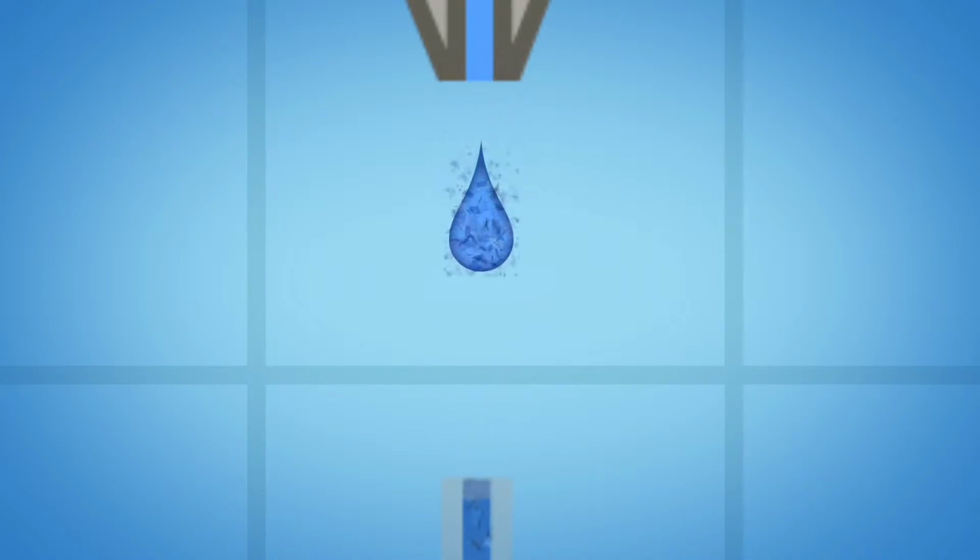As they fly through the atmosphere, they are prone to evaporation. As they evaporate in flight, they get smaller and their surface area decreases. As the surface area decreases, the analytes carried inside the droplet move closer and closer together.